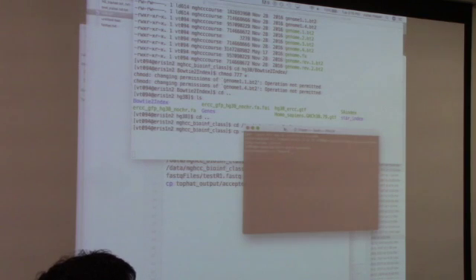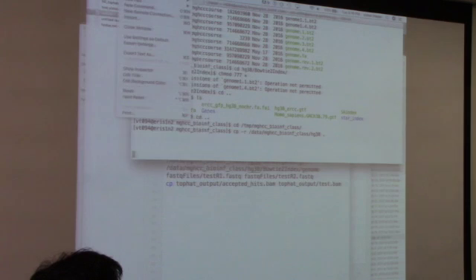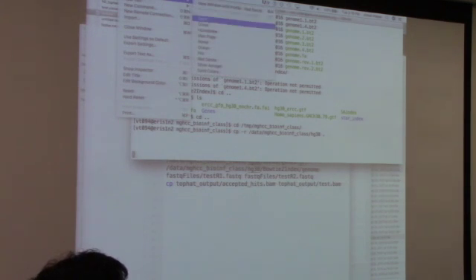In the meantime, if you want to figure out how the alias things work, here's a simple thing you can do.